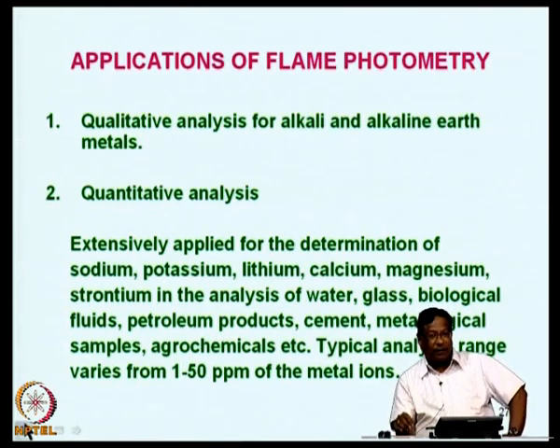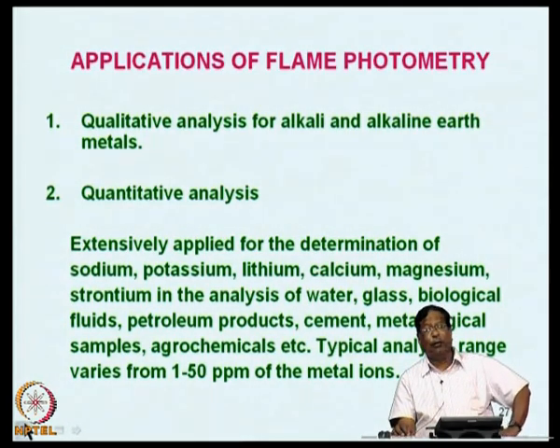So, that completes our discussion on flame photometry, because I do not want to convey to you more information, as it is basically a very simple system. Anyone with minimum educational qualifications who knows how to operate a flame photometer can keep on working, but to understand the complexities involved in the analysis is more important for you as a chemist, as well as for others, to interpret the results.